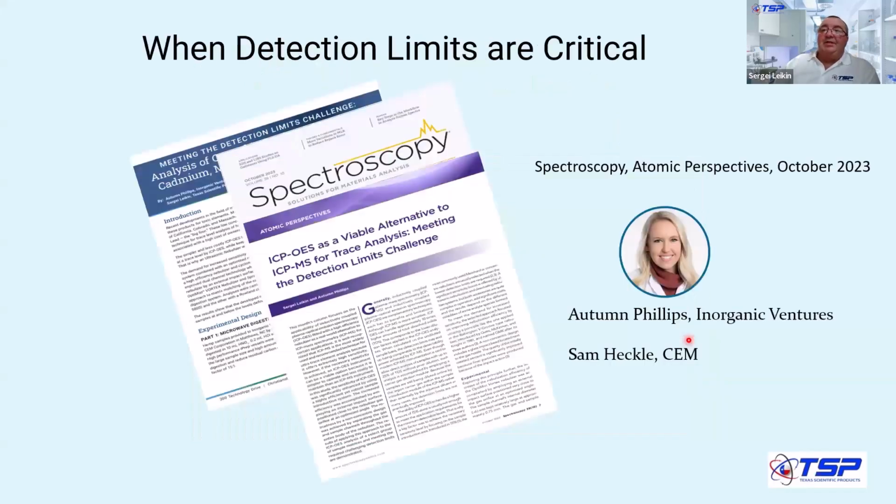So the next application is when the detection limits are very low, but what if you don't have an ICP-MS for that? Again, I will refer to the paper that we published in Spectroscopy in 2023. The work was done by Autumn Phillips, R&D chemist at Inorganic Ventures. It was a collaboration, so folks from CEM helped us with digestion.